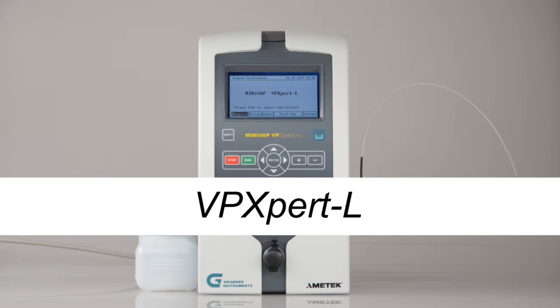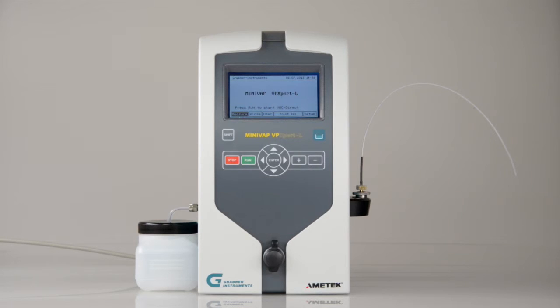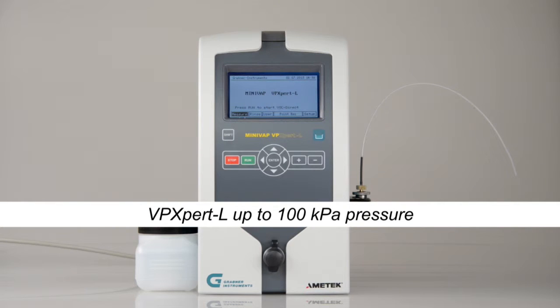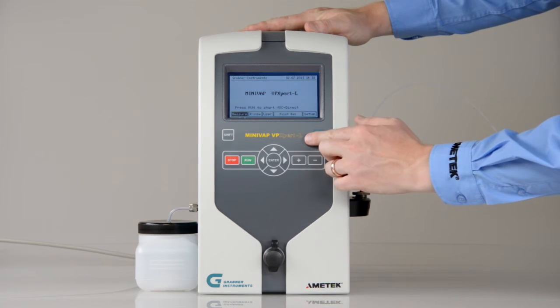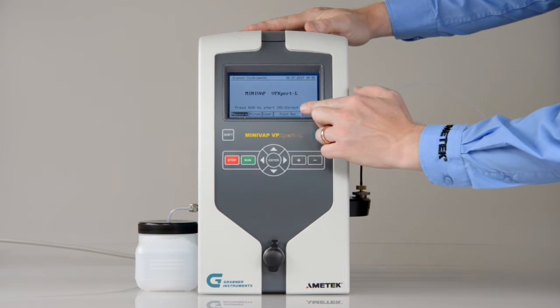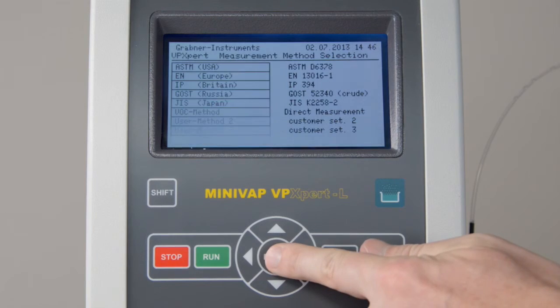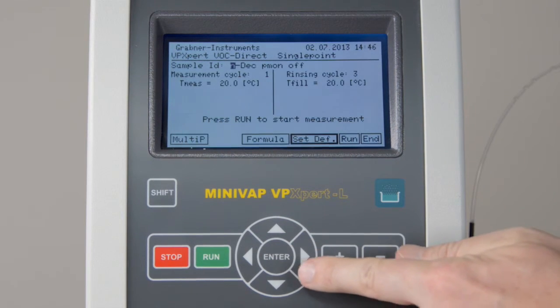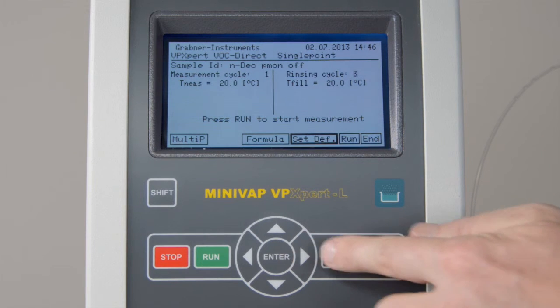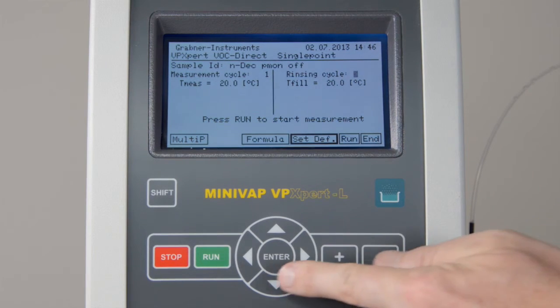VP Expert L, low volatility vapor pressure tester. The VP Expert L is specified for low volatile compounds up to 100 kPa. This instrument contains the same methods as the VP Expert. Additionally, a direct and an extrapolated method for low volatile compounds are available. To measure the absolute vapor pressure, select a VOC method. If you have tested a different substance before, increase the number of rinsing cycles for additional cleaning.